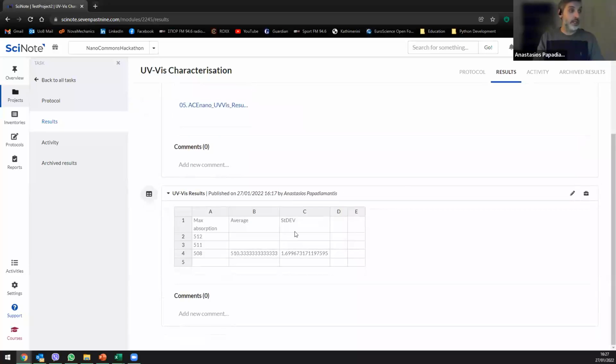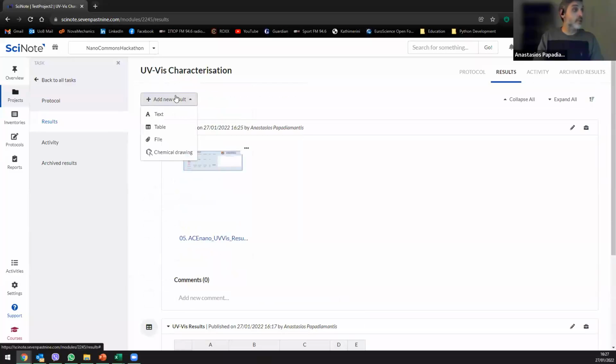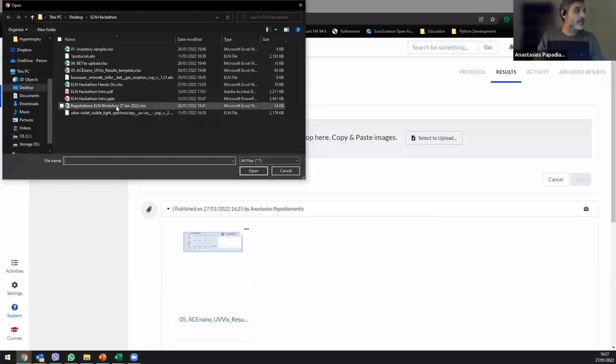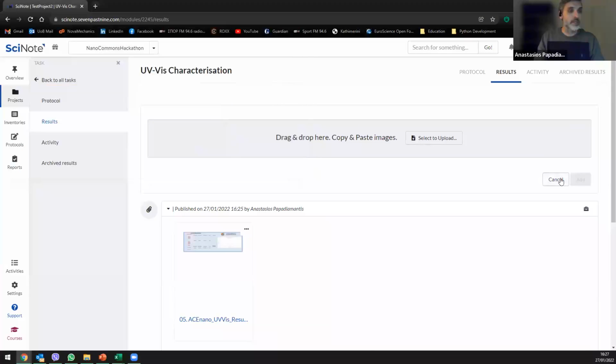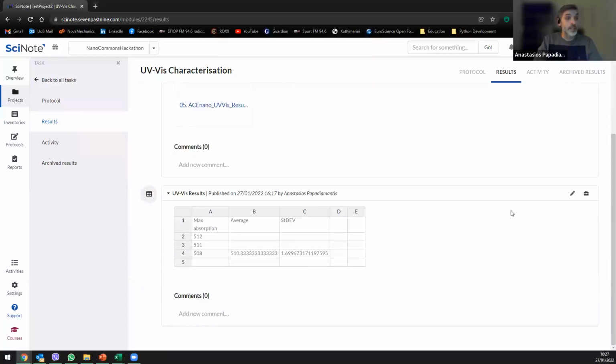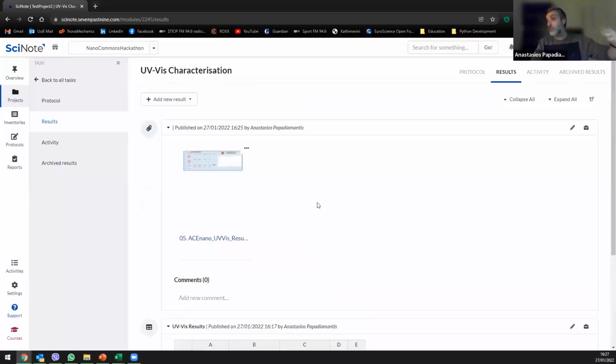We'll look into it and come back. And of course, there are other ways you can do it. You can again upload stuff. So theoretically, that's another part, and so on. And in this way, you start capturing the results.